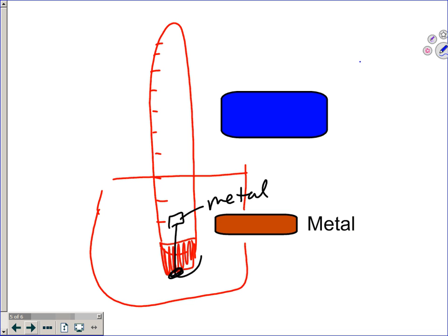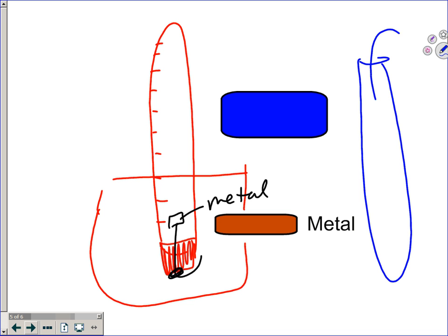So what we'll start with is a eudiometer tube that's upright, and we'll put, how do you safely add acid? So add acid to water, do what you oughter, right? So you'll have your water in here first. Don't fill it even halfway with water, just put some water in there so it dilutes it as you add your acid. You'll add your acid, and then you can fill on top with water till you get this 100% full.